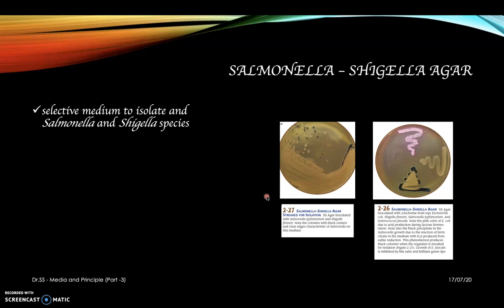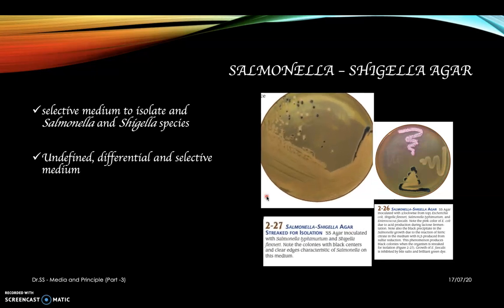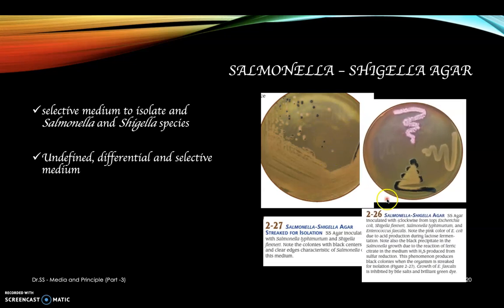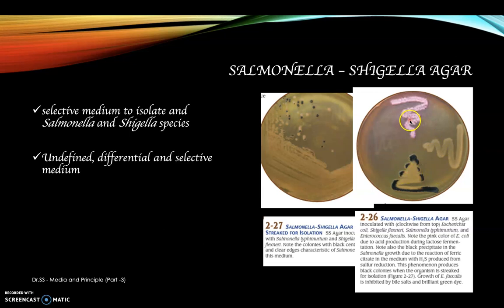Salmonella Shigella agar is used for the identification and isolation of Salmonella and Shigella species. It is an undefined differential and selective medium. Two organisms are streaked: Salmonella typhimurium and Shigella flexneri. Black-centered colonies indicate Salmonella species. In a second plate, four organisms are streaked — E. coli, Shigella flexneri, Salmonella typhimurium, and Enterococcus faecalis. E. coli ferments lactose so appears in a different color. Black colonies are formed by Salmonella typhimurium. Enterococcus faecalis cannot grow on SS agar.